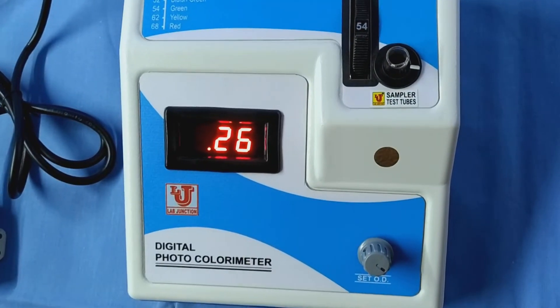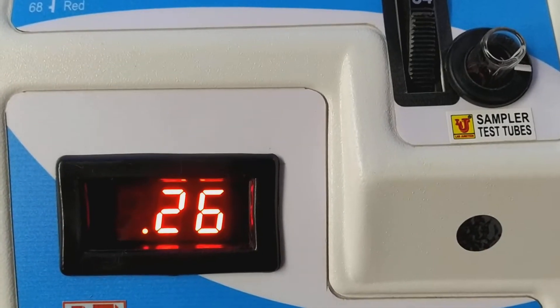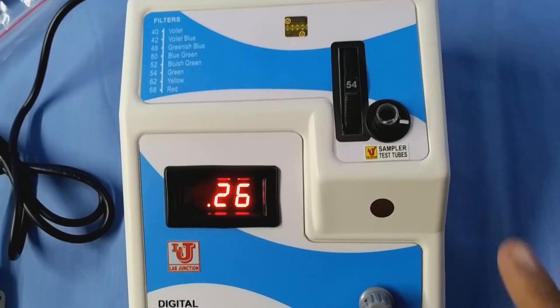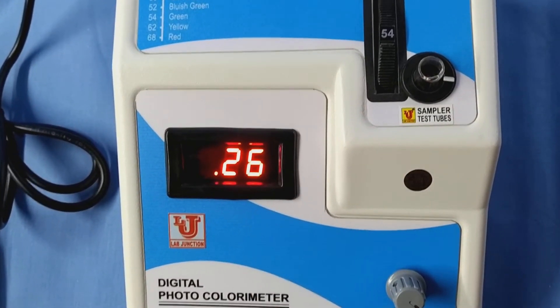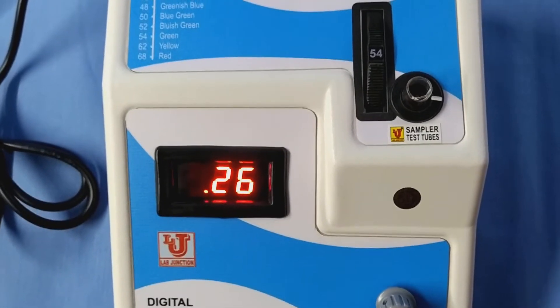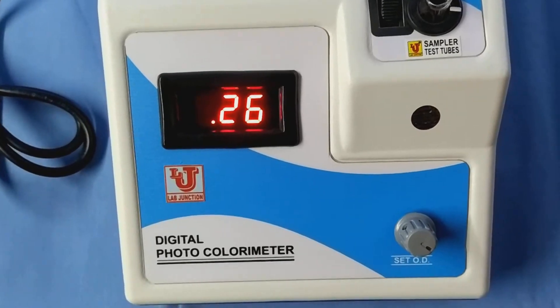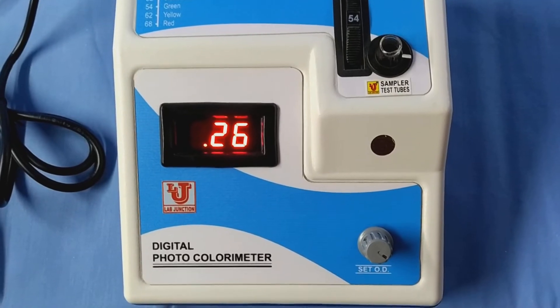This is your result in absorbance or optical density. First, set 0 on blank. Then take the optical density or absorbance of your sample. Third, take the absorbance or optical density of your reagent. Then calculate with the help of a formula. This is the final result of the colorimeter. After that, you have to do calculation as per your parameter.